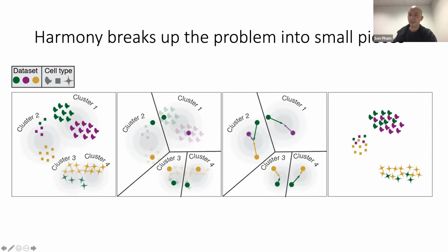Next question. Can you run Harmony with two very different data sets? Do you need to downsample them? Yes, and you're right to be worried. Let me actually augment the question. Harmony itself should be fine. I would worry about the steps leading up to Harmony, right? If you do gene scaling, PCA, those steps, if you don't account for different sizes in the data sets, they're going to be very dangerous. If you're interested, I would read the paper.